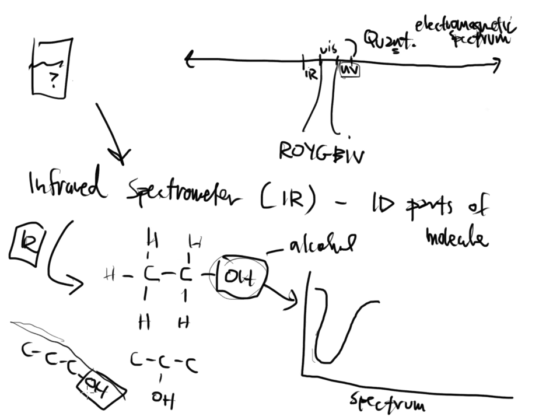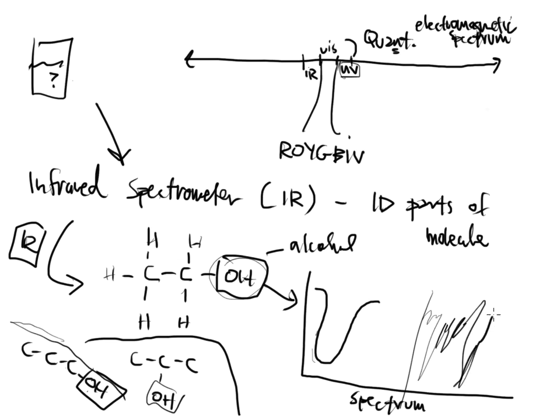If ethanol did it, then that OH will do it on that molecule, and this OH will do it on isopropyl alcohol, which is rubbing alcohol. They all would show up the same way. The problem is that over here on the right-hand side of the spectrum, there's going to be a lot of garbage that shows up. I mean, there's going to be lines all over the place.